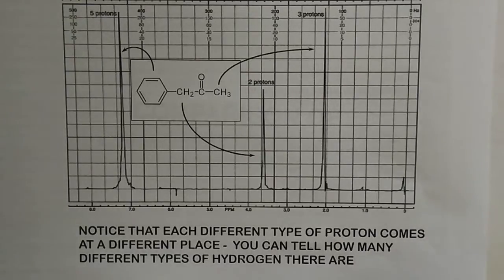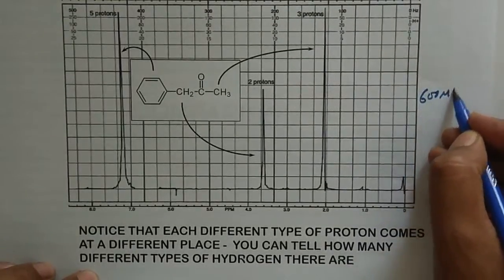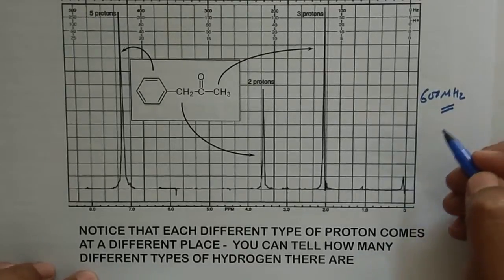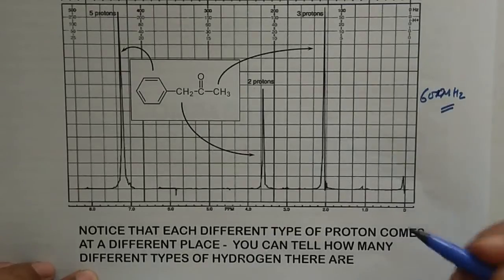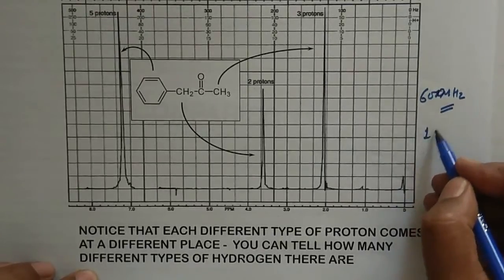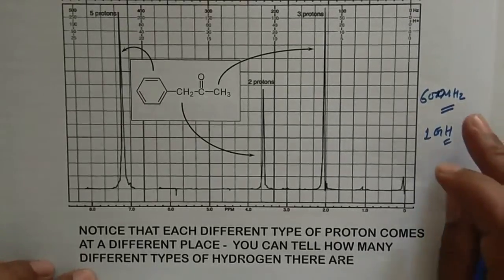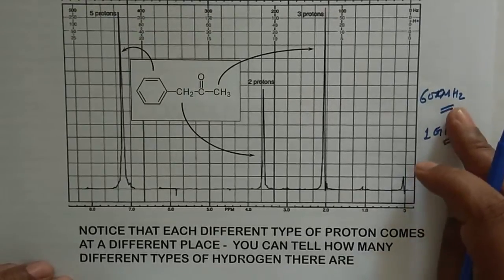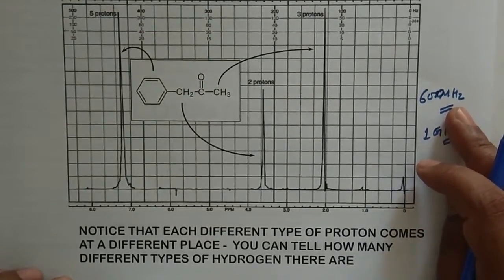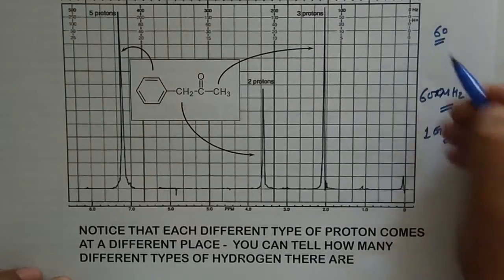If you are doing natural product research or synthesis, and you are interested in small molecules, then a 600 megahertz machine, 500 to 600, is quite enough. But if you work with proteins or polymers, then you may require a 1 gigahertz machine also. For small molecules, for the natural product chemist or the synthetic chemist, up to 500 to 600 megahertz is quite enough. But initially in the CW case, we used 60 megahertz.